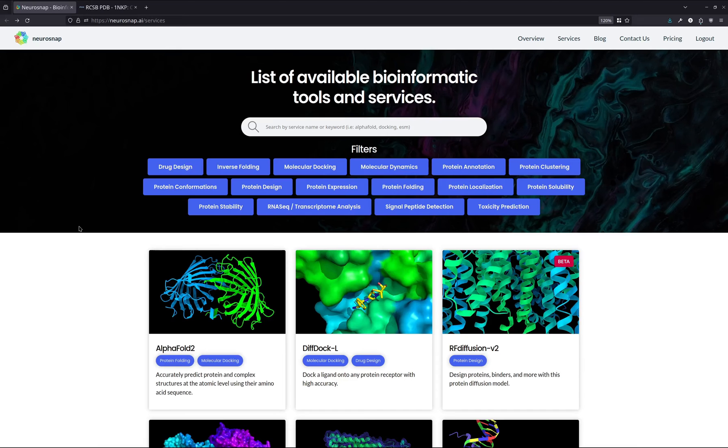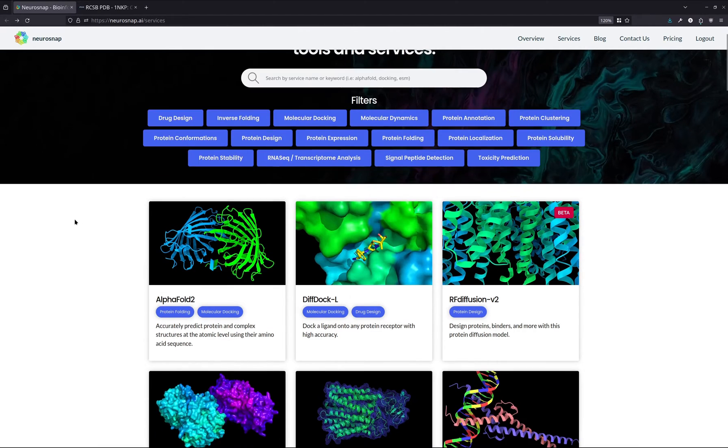In this video, we're going to be showing you how to use the RosettaFold All Atom model using the Neurosnap platform.